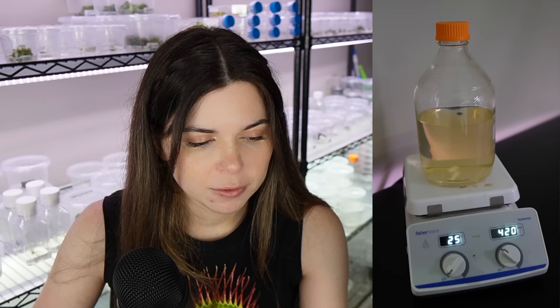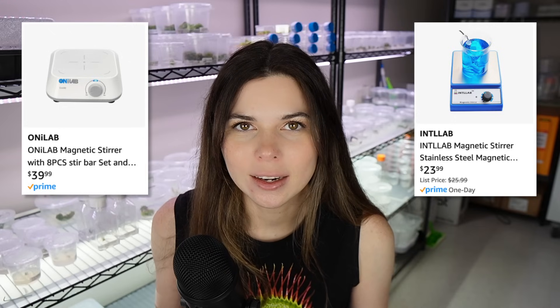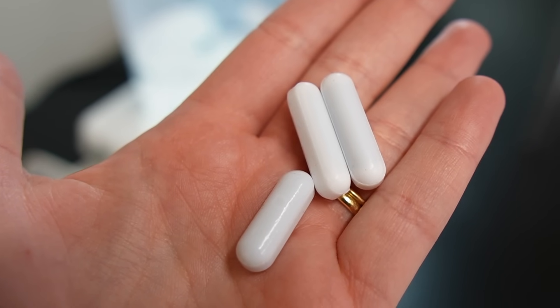The reason that this particular magnetic stirrer is so expensive is because it also has a hot plate component. I seldom, if ever, use the hot plate — I basically never use it. Sometimes I'll turn it on to prevent my media from congealing into a gel too quickly after autoclaving before I can pour it, but that is the only time I ever use it. I wouldn't even recommend purchasing one of these refurbished. I would instead just march on over to Amazon and purchase a cheap one there. I have two that I recommend and they're both pretty inexpensive. And to really pimp out your magnetic stirrer, I would recommend getting some extra stir bars — the stirrer will come with one, but you're going to want more than one.